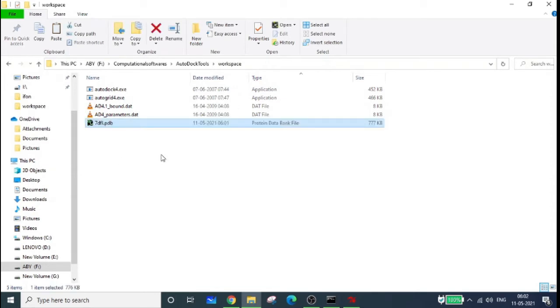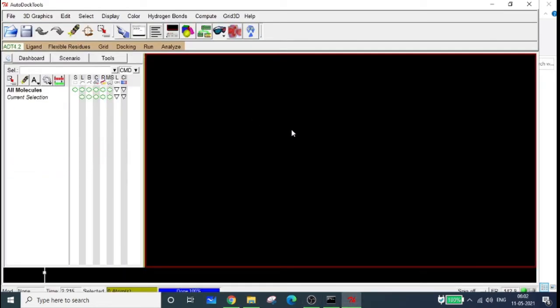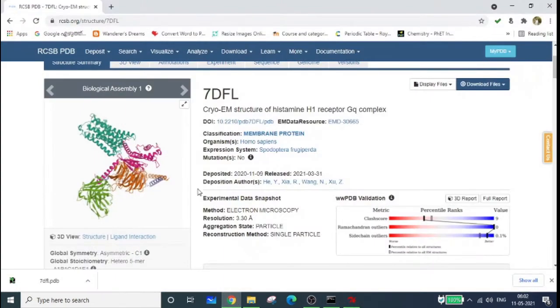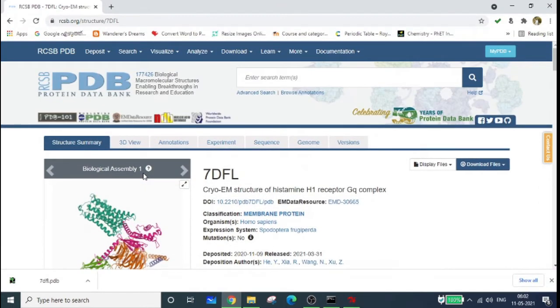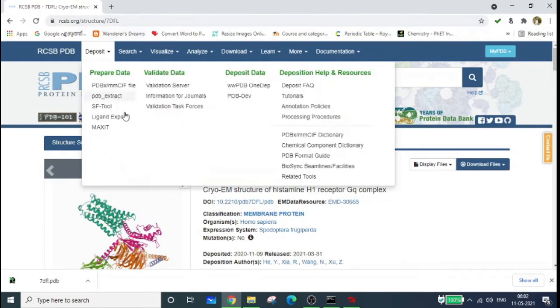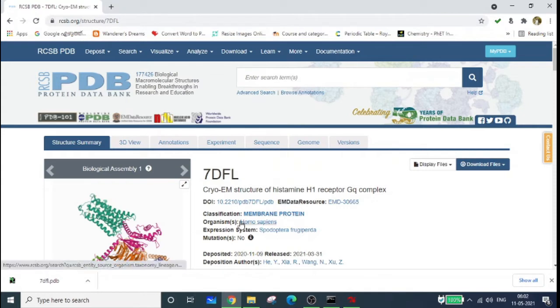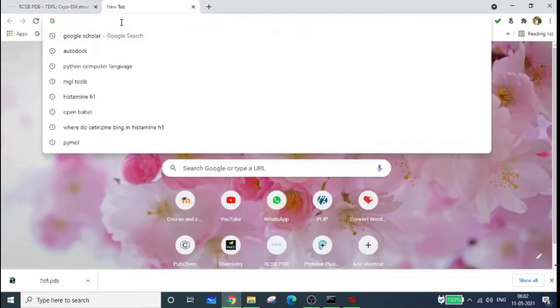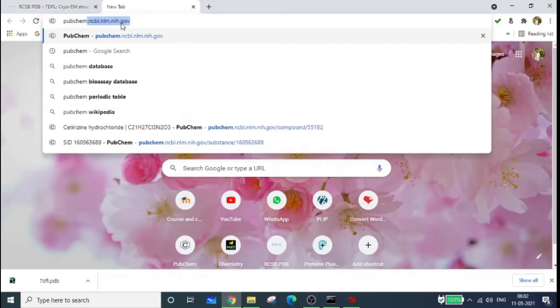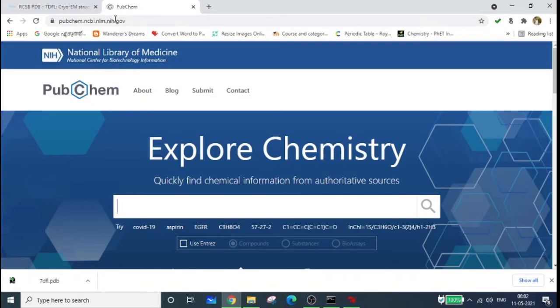The structure is now in the workspace. Now let's get the ligand — currently we only have the protein molecule. You can search for cetirizine in PDB or in PubChem. Let's search for the ligand in PubChem.